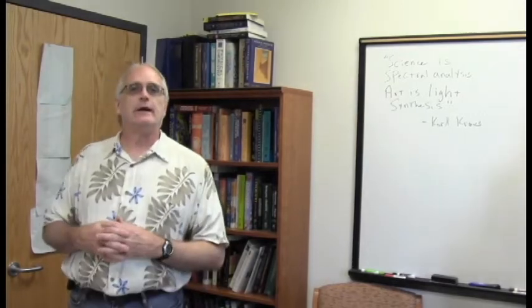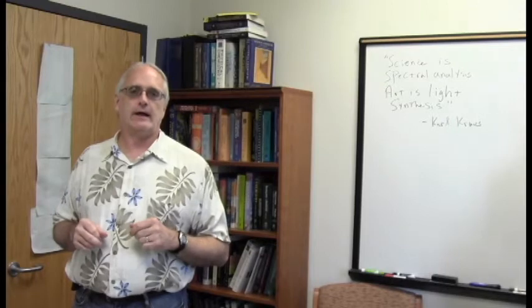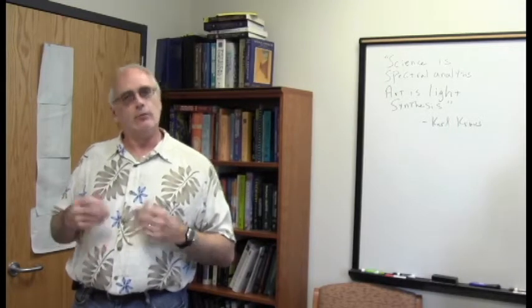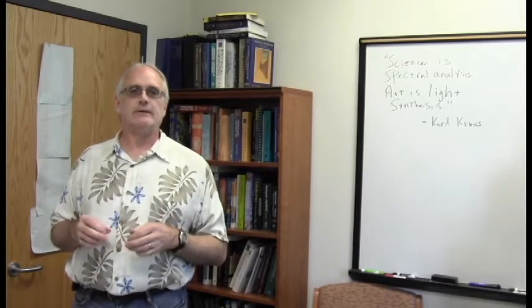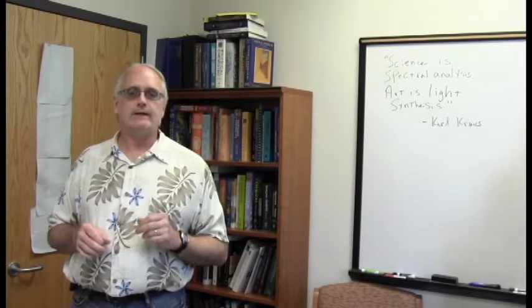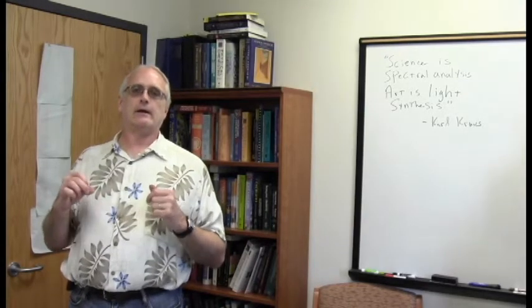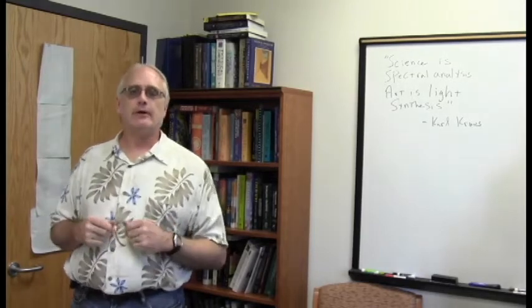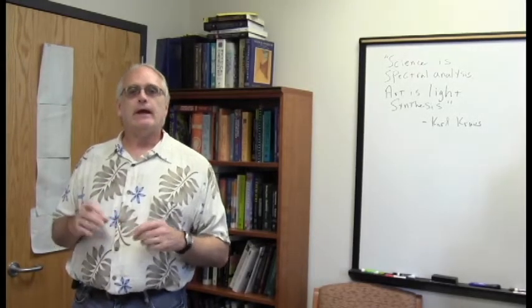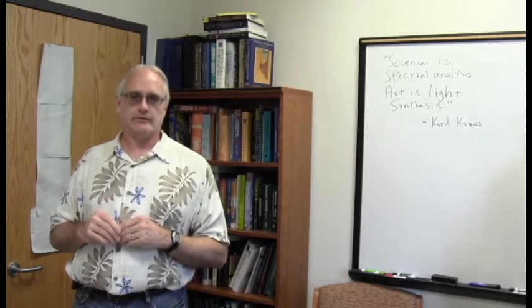Now, I must admit, I enjoy it when a student ends a message like that by asking me what the facts are, because it tells me that they're deeply interested in the answer. And the student is exactly right. The hydrogen spin states should show up in our carbon spectra. And so I want you to take a look at the moment at this particular spectrum.